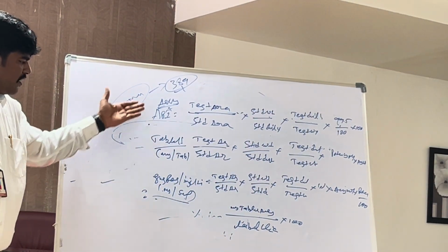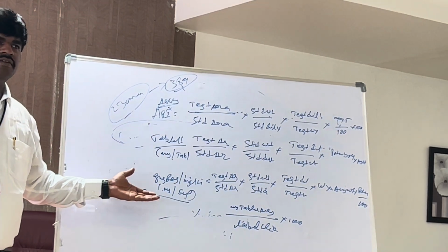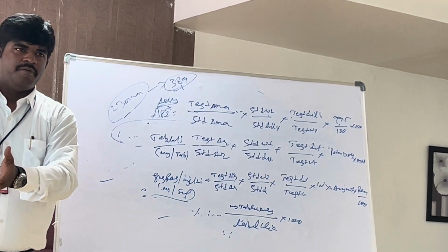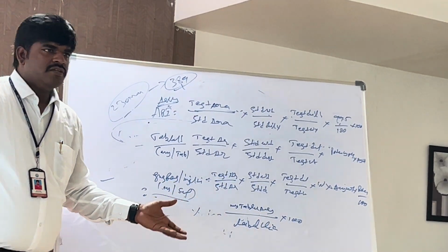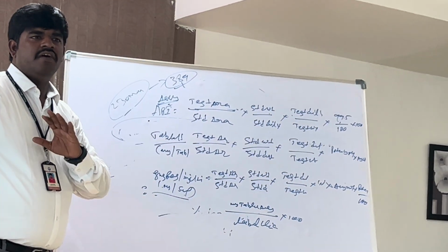When compared with the API, injection analysis is far easier. You don't need to prepare any solution, simply you take this much volume, you pour it into the flask and you get the result. So, leave aside the formulation, this is the simplest way. Anyone can do any test.